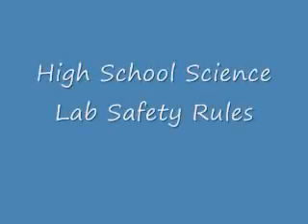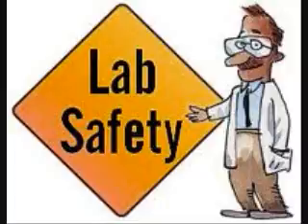High school science lab safety rules. Every student should have the right knowledge of safety lab rules when getting into high school. Before anyone ever steps into a lab to do any type of work, they should be well taught on the safety lab rules that should always be followed in each and every lab assignment. Safety in the science class is the number one priority for students and teachers.